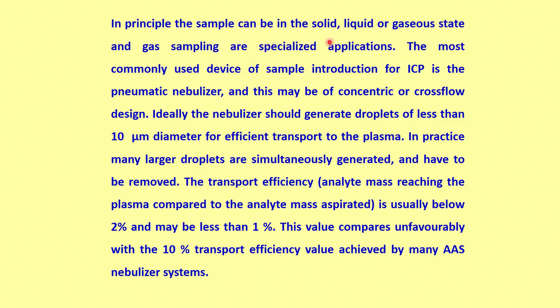So, in principle the sample can be in solid, liquid or gaseous state, and gas sampling is a very specialized application by itself. Normally, what I expect is that the introduction of a sample as a liquid is simpler than introduction of a sample as an aerosol, because in analytical sciences most of the time we have been talking about parts per million, parts per billion level analysis only.